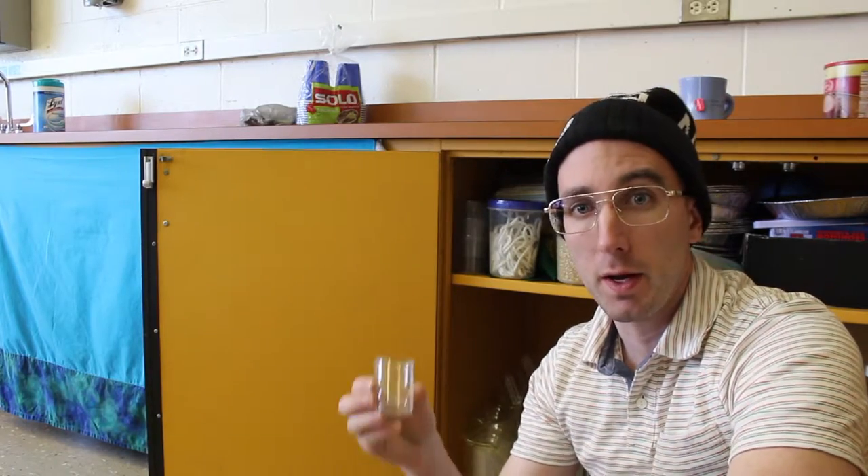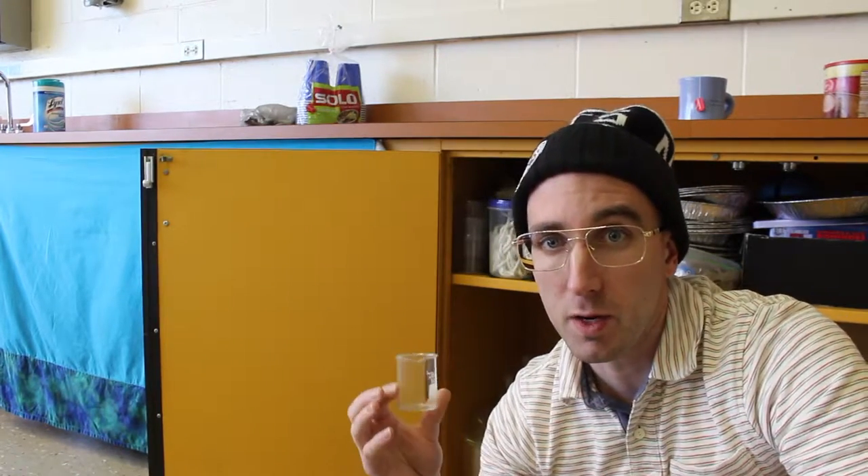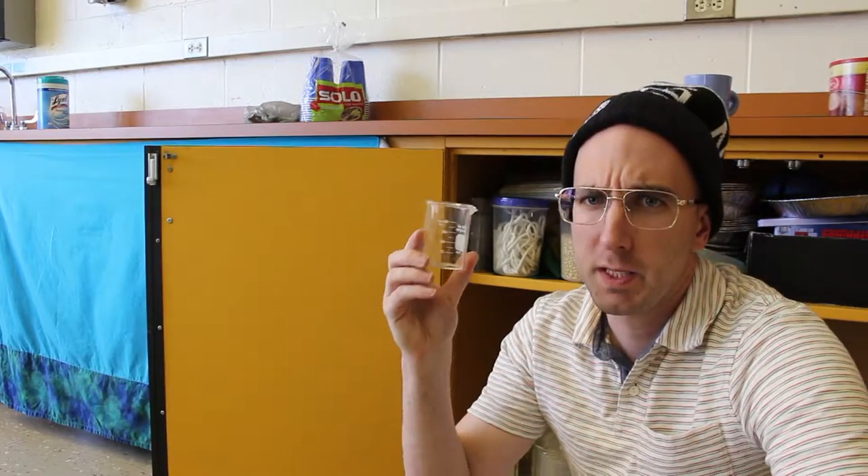The most basic thing you can practice for glassware safety is to inspect it before use. Obviously, if you have cracks in the glassware and then you heat it up, there could be problems. In our classroom, boiling water can cause the glass to expand, and cracks in the glass can cause problems — nobody wants boiling water in their eyes.